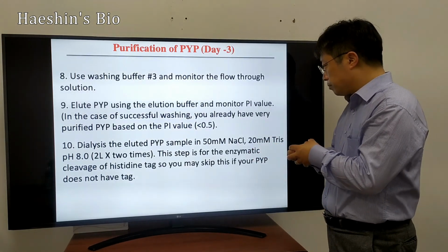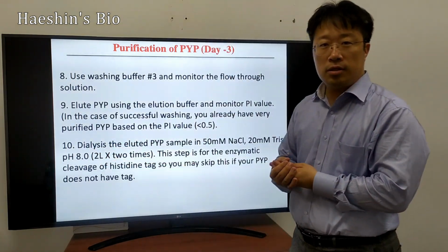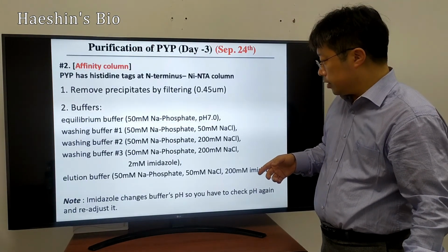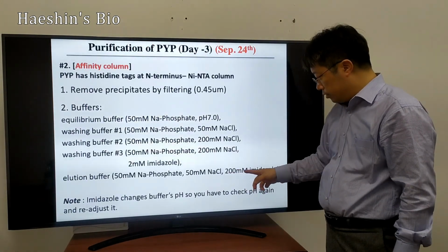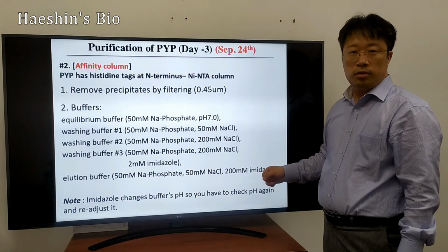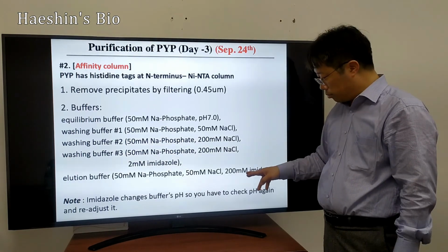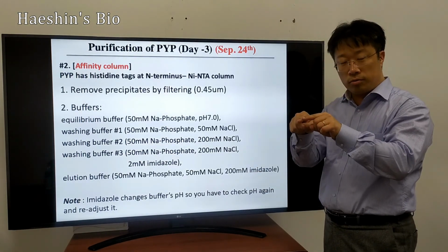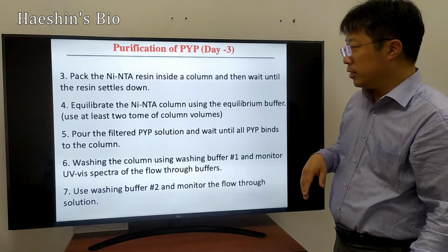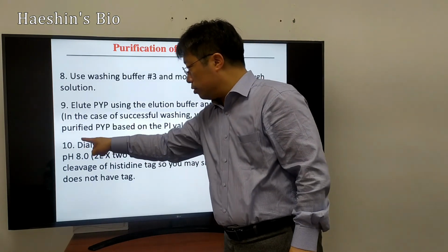So now we have to do dialysis. The reason is that you added, for elution, in this case, 200 millimolar imidazole molecules in solution. But this is a small molecule. It's a 5-member ring molecule. It has to be removed from this system. So that's why we perform the dialysis.